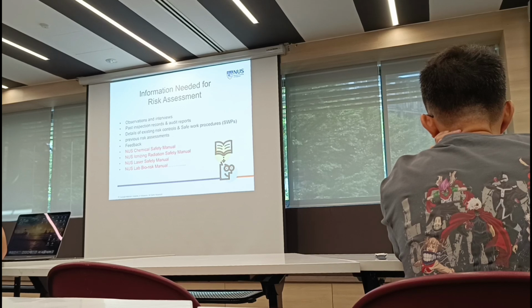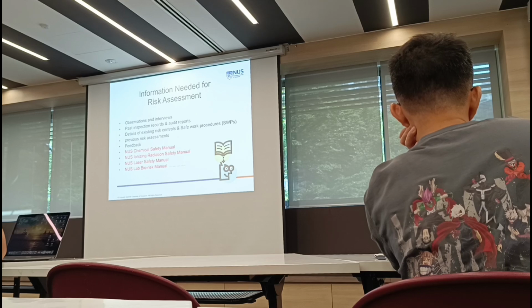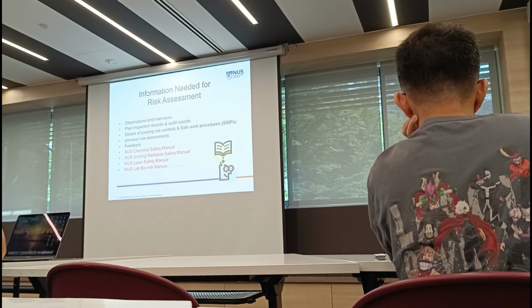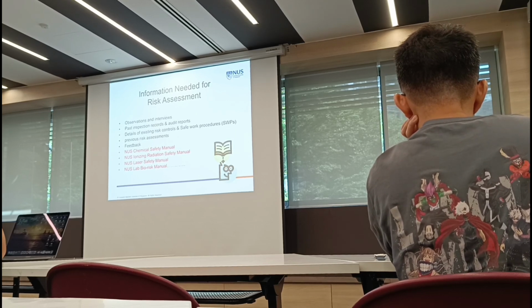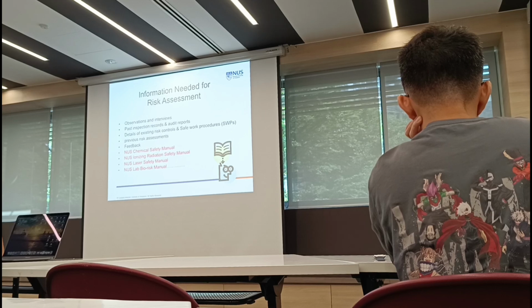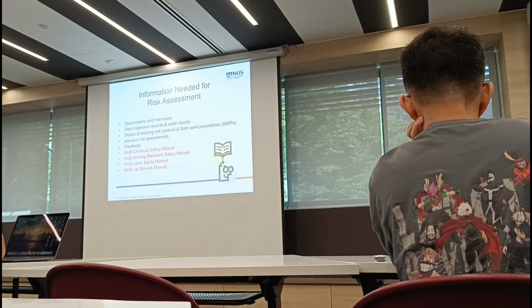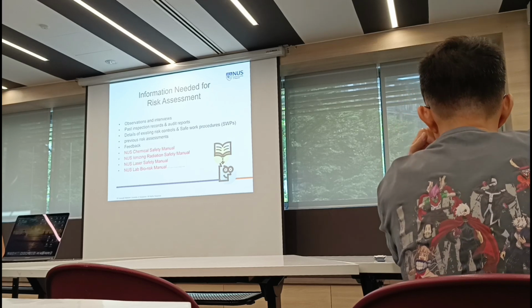So as I mentioned, usually you are joining a project. It's very seldom you are doing something really, really new in a research group, especially when you start, right? You probably do something what other people have done. So you can actually use the previous risk assessment as well from your seniors. But do not just copy directly, right? That's another mistake many students make. They just change the name at the bottom and then submit.